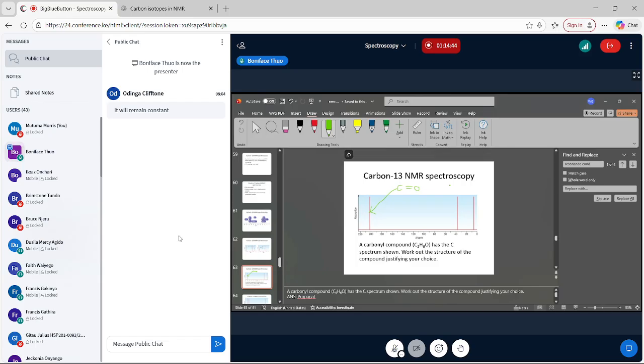So that probably tells us that we have a CH2 group and a CH3.